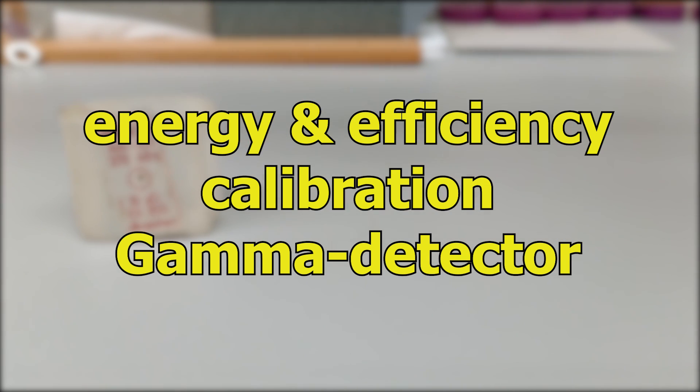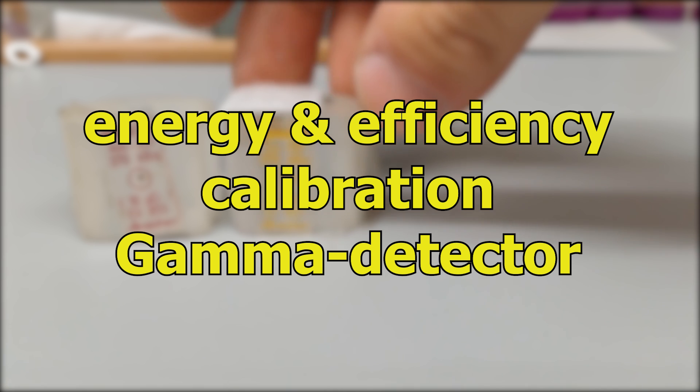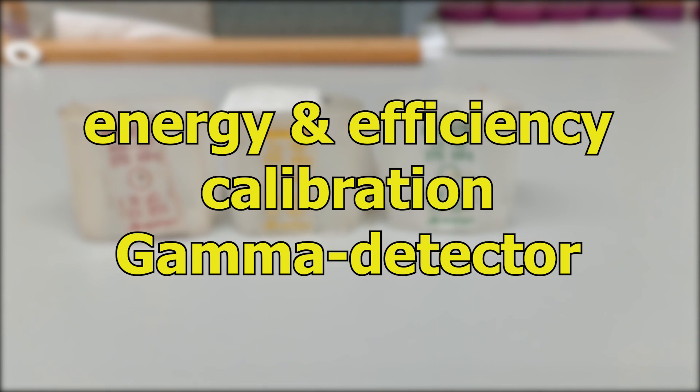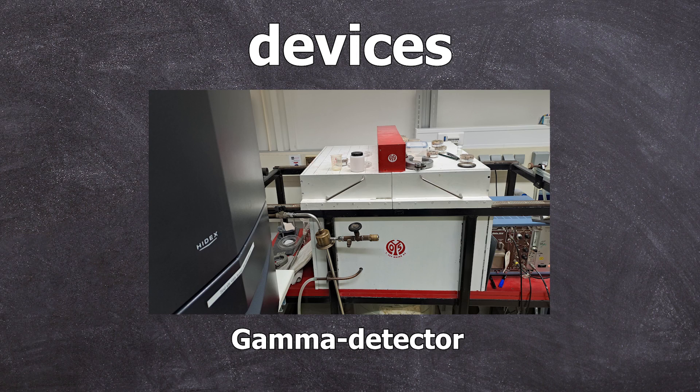Today, we are calibrating for the energy and efficiency of the gamma detector. The gamma detector is based on a germanium crystal doped with lithium, which is why it's often referred to as the GeLi. This calibration process is done entirely on the computer and no chemical reactions are involved in this video.